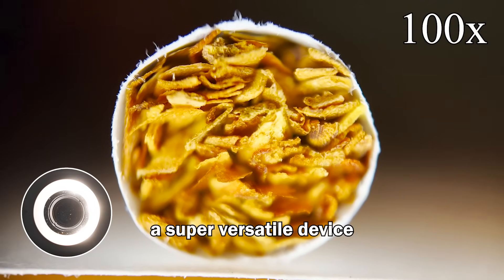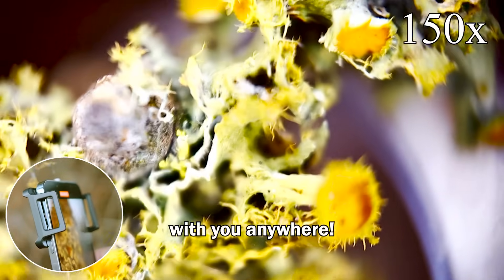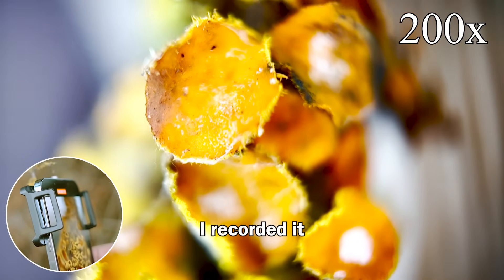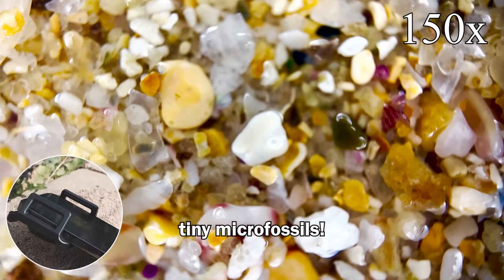A super versatile device that can be used on any smartphone — it's super cool. You can take it on adventures with you anywhere. I went recently on a hike and found this super cool light and recorded it straight to my phone. I tried it out on some beach sand as well — you can see the super tiny microfossils.